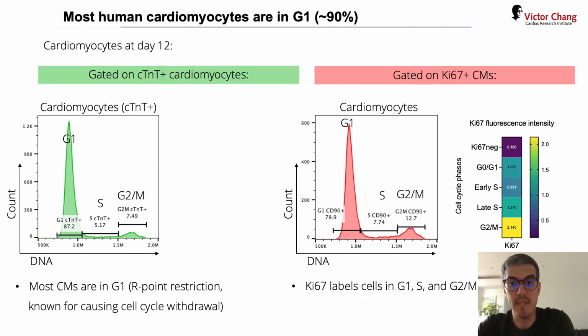Using Ki67 mean fluorescence, we next determined that the quantity of Ki67 per cell is higher in G2/M or 4N cardiomyocytes. Thus, our data highlights the accuracy and high throughput potential of flow cytometry to map the human cardiomyocyte cell cycle and provide a better entry point for deeper analysis of cardiac cell cycle behavior in homeostasis and disease.